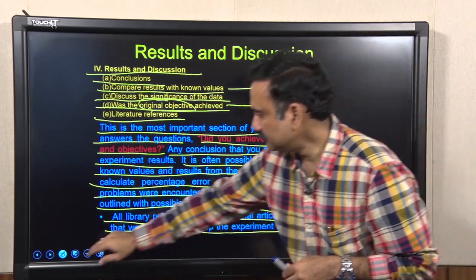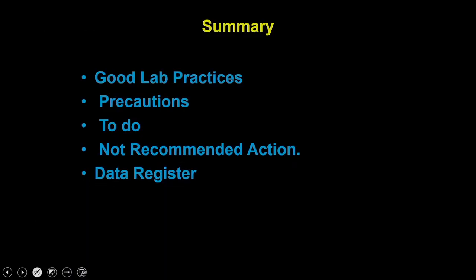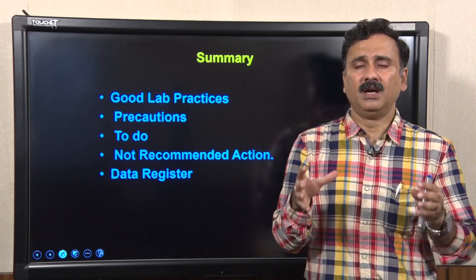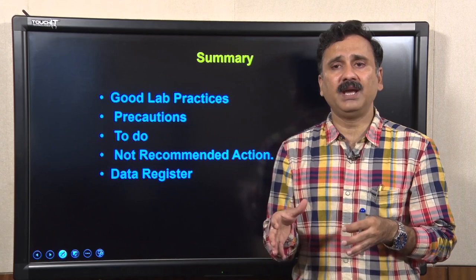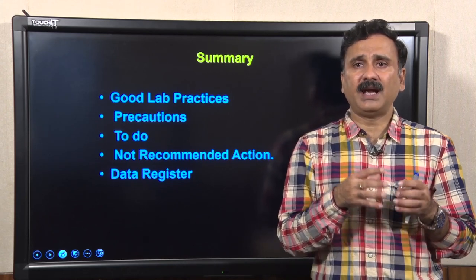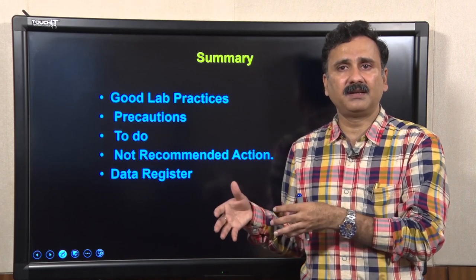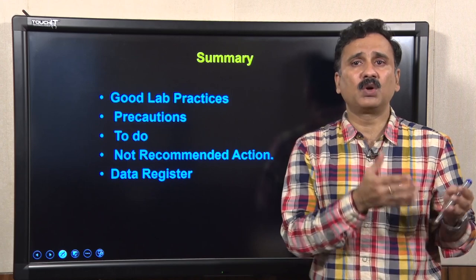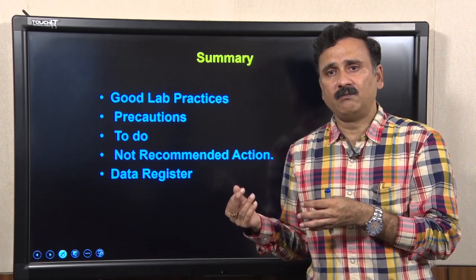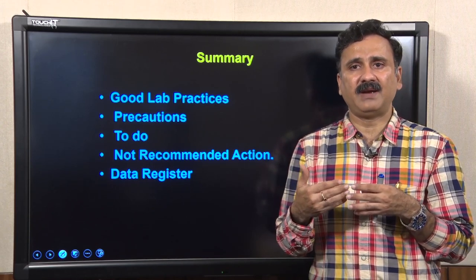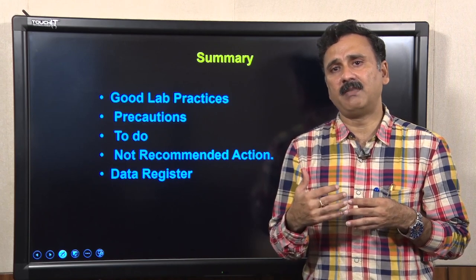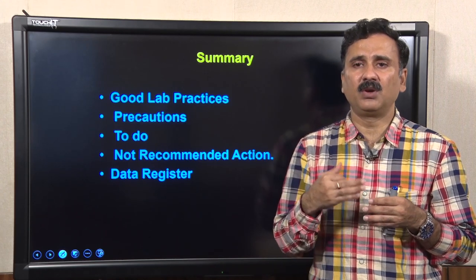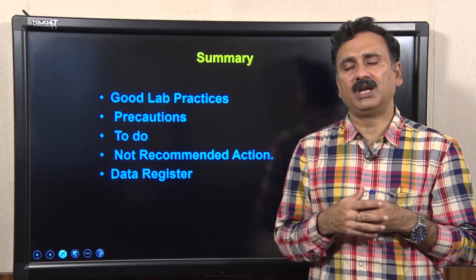In summary, we have discussed good lab practices: how to conduct yourself in the lab, what actions and precautions to take, how to handle accidents and fire hazards, what information is required when opening chemicals and how to use that information to avoid exposure and accidents, and finally how to document experiments properly in lab notebooks and what components are required. With this, I would like to conclude my lecture. Thank you.